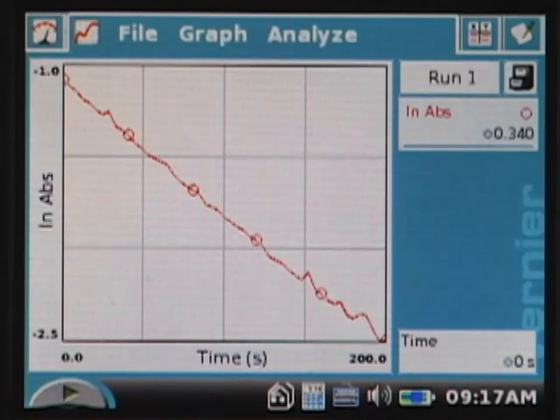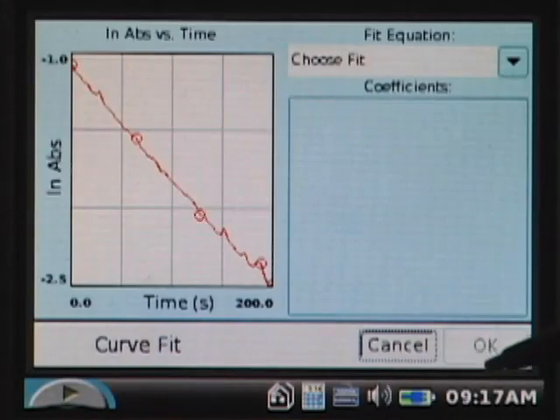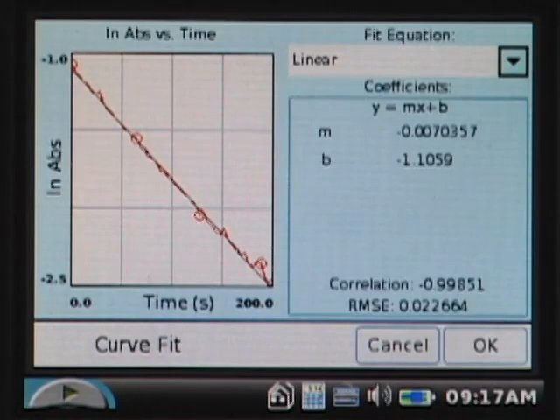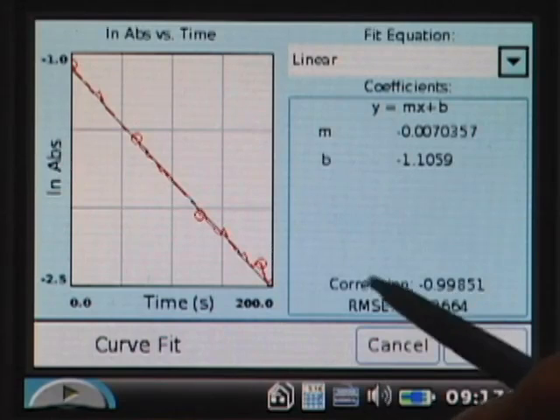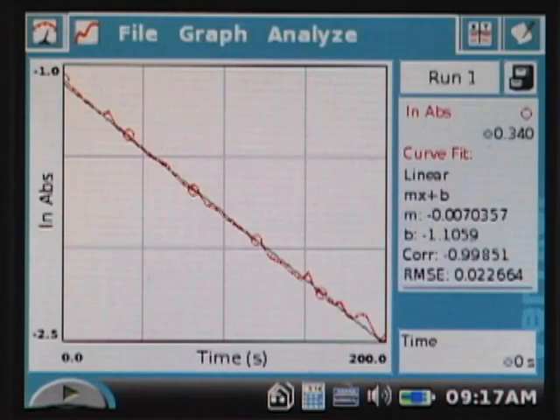That looks like more of a linear plot, which would suggest a first-order reaction — but let's not jump to conclusions. Going to Curve Fit on natural log of absorbance and choosing linear, the correlation coefficient this time is 0.9985, essentially 0.999. That's a very nice linear fit, and that would suggest this reaction is first order with respect to crystal violet.